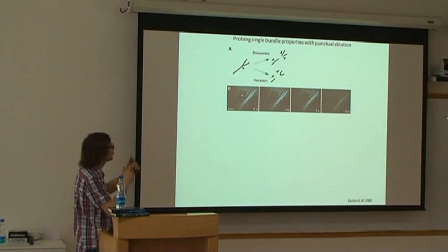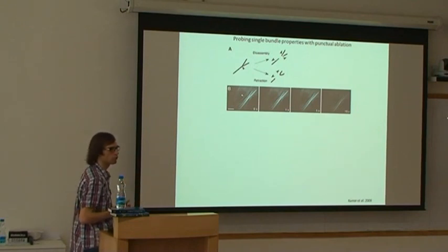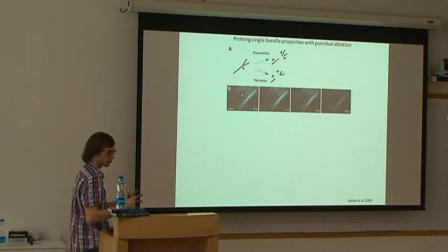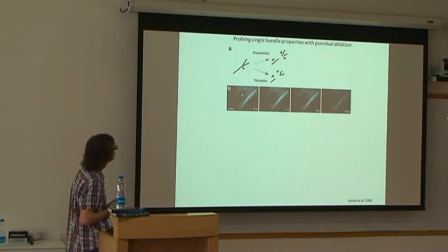These fibers are attached to, I think, the extremities of the cell. And they are then attached to the focal point. You know, I think this cell, I don't know, it's zoomed in, but I'm sure this has an extracellular matrix. So certainly there are integrins, thus it is attached to it. And then on the focal points of attachment, these fibers will join to these focal points.